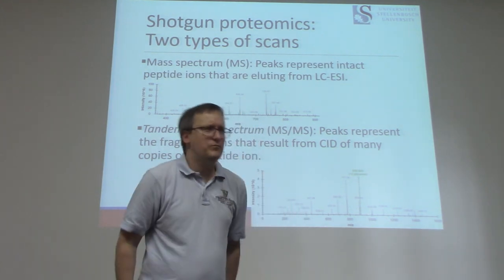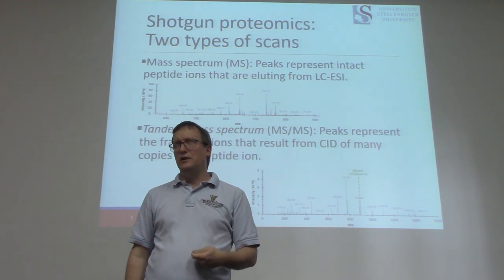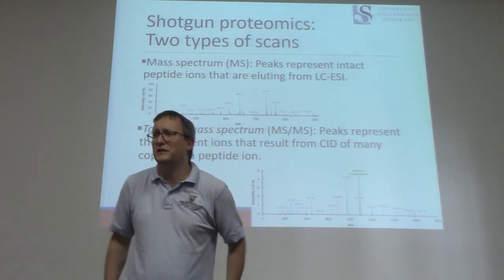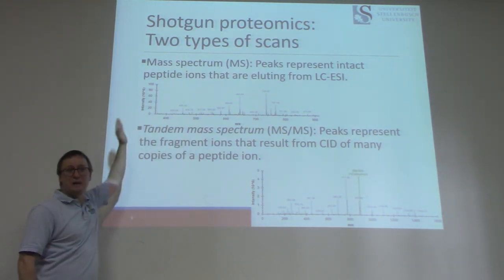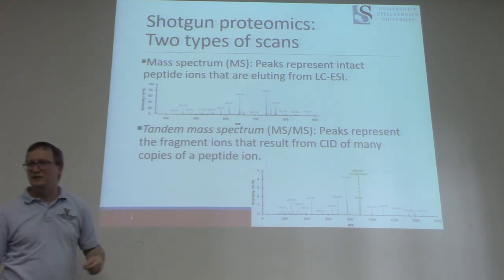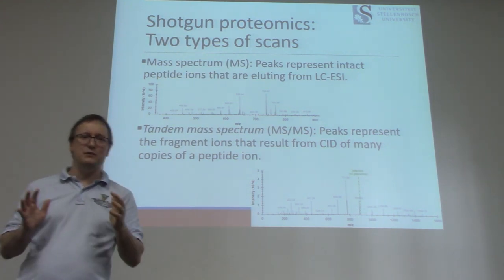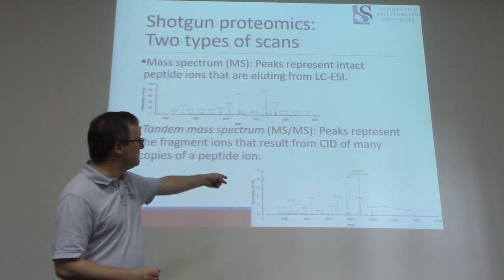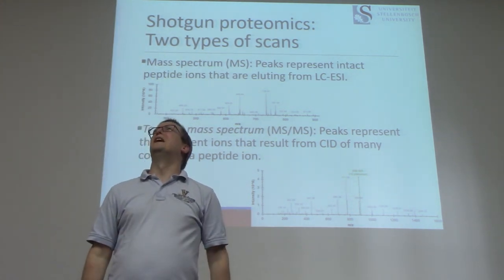Okay. All right, so a very key difference for everybody to know, a question that I seem to ask every year, I don't know quite why I do this one, but it's one that I really, really like. We have mass spectra, we have tandem mass spectra. Understanding why these two are different really matters to me. A mass spectrum shows you what's available from electrospray at this particular moment in time. A tandem mass spectrum is the death cry of a peptide. I'm sorry, that's very romantic.